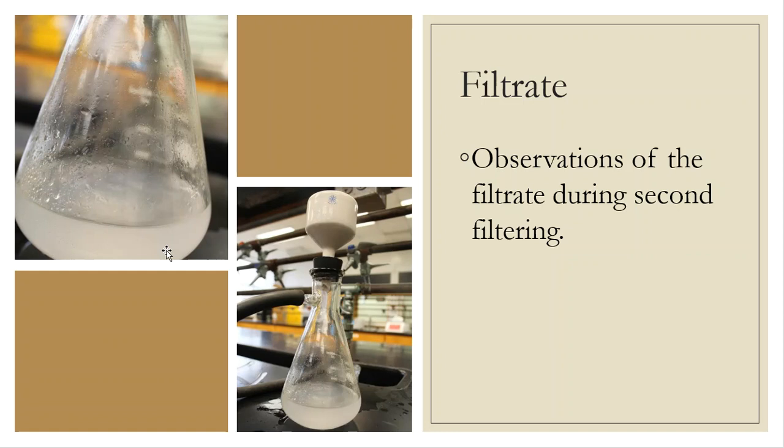As long as I'm not seeing solid form, then I can ensure that I've got the majority of what I needed out. However, if my percent yield is low, then there could be a little bit remaining in this step, and I just didn't have the patience to wait for it even more so. So, is there some left over? Could there still be some more that filters out? Maybe. Maybe. But it could take an hour. And I'm not going to wait here for an hour in order to do this.